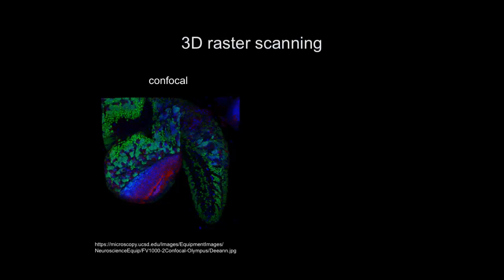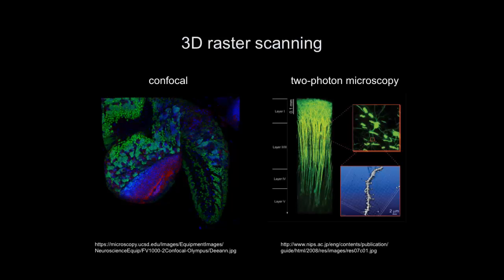So, and that works beautifully well. I mean, both methods work great. So here's a beautiful picture that I just ripped off the internet. Here's the coordinates if you're interested. This is a Drosophila brain slice that labeled a lot of the bodies, the bodies of the neurons, here with a fluorescence indicator. And this is a three-dimensional reconstruction of that big part of the brain. You see, you can actually create beautiful three-dimensional reconstructions of tissue.